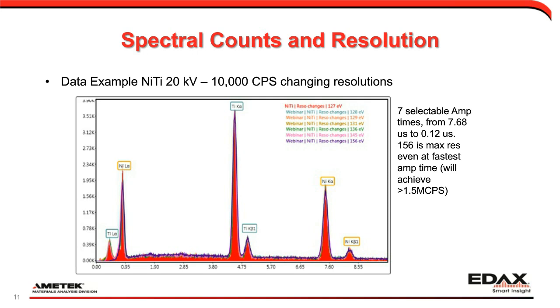And so the older generations of detectors, the silicon lithium detectors, the SiLi detectors, would allow us to work just at a few thousand counts per second. Nowadays, with the silicon drift detector, I'm just getting started at 10,000 counts per second. Really, I say to get started, 10 or 20,000 counts per second is a good range. And that's provided that you're working at something from, say, 5 to 20 kV on a moderately conductive material or a material that you're working on in variable pressure. And then you should easily be able to adjust your beam current to achieve the 10 or 20,000 counts per second.